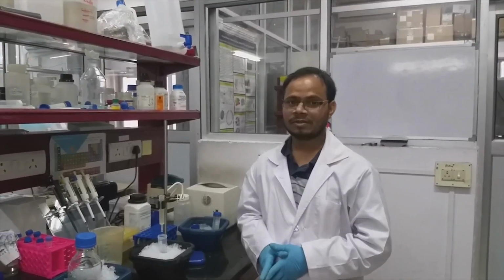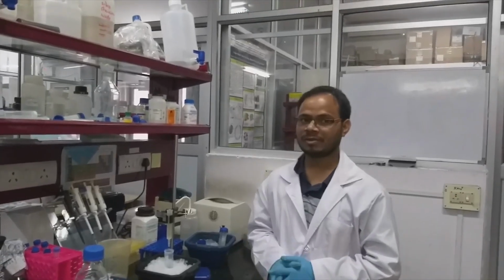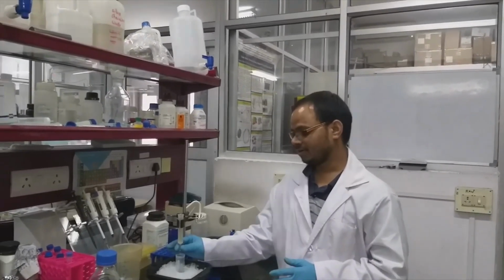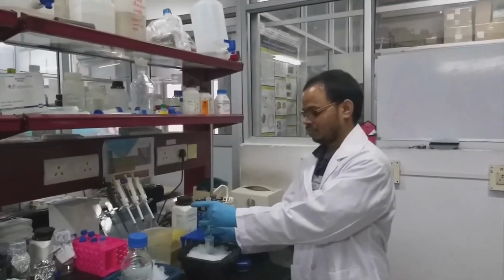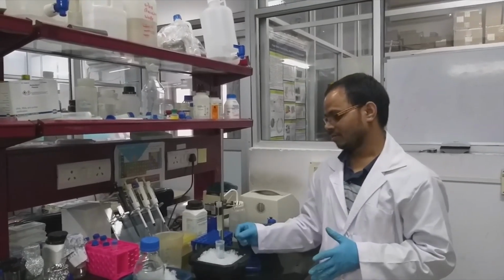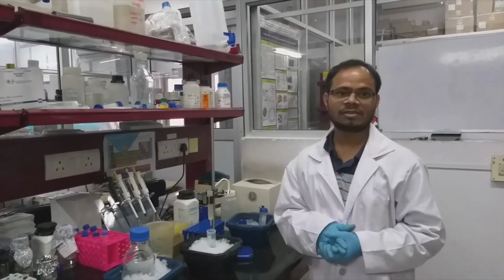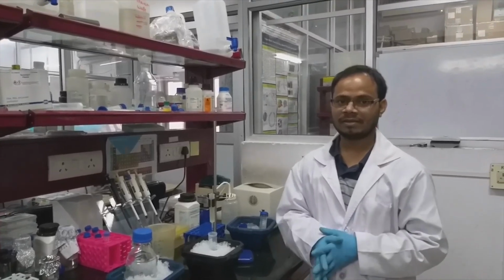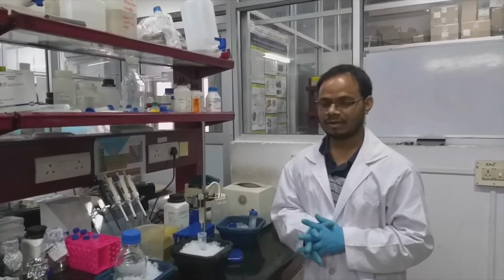After incubation with beads, we have to follow another 3 steps to get the purification done. First, after the beads are taken out from ice, you have to remove the outlet so that all the flow through other than beads will be taken out. The next step is we have to wash with the equilibration buffer, and the third step is we have to elute the histidine-tagged protein using imidazole containing buffers.